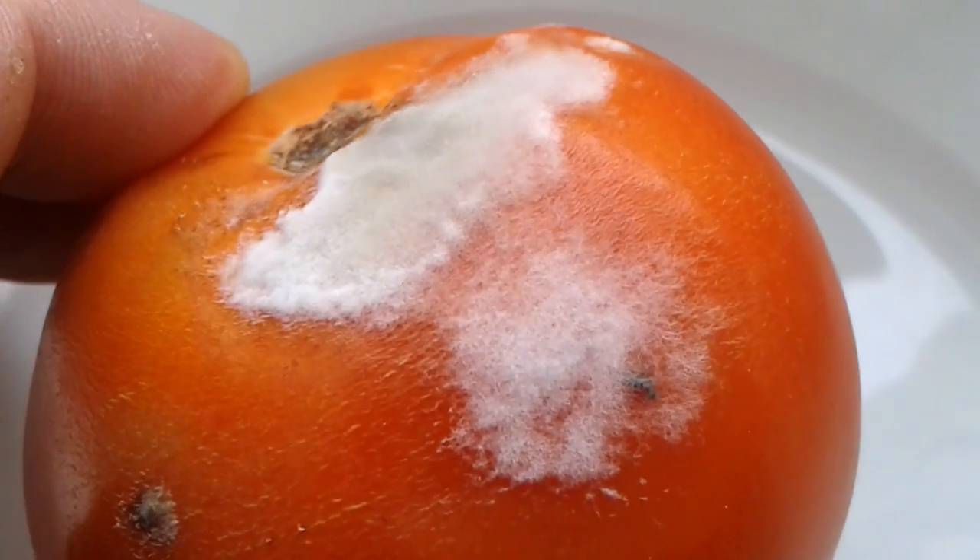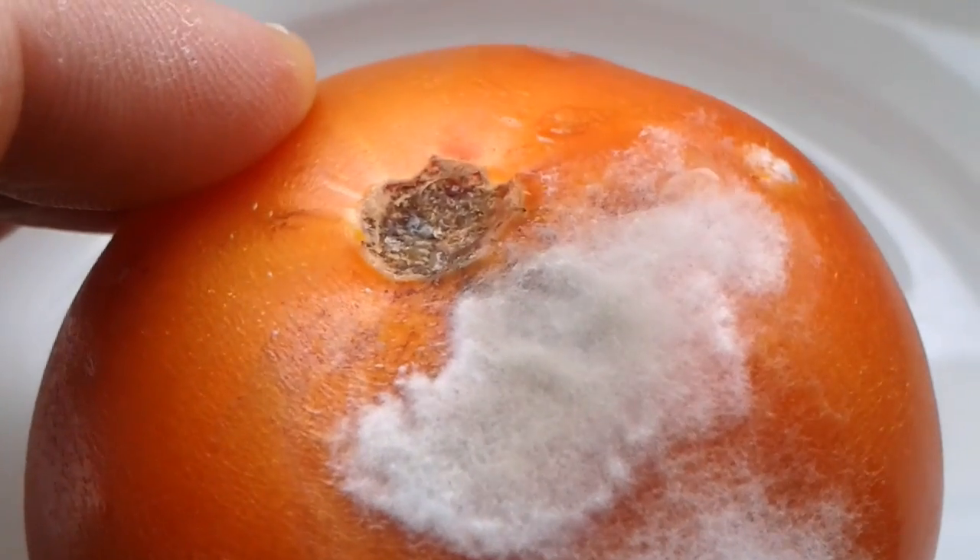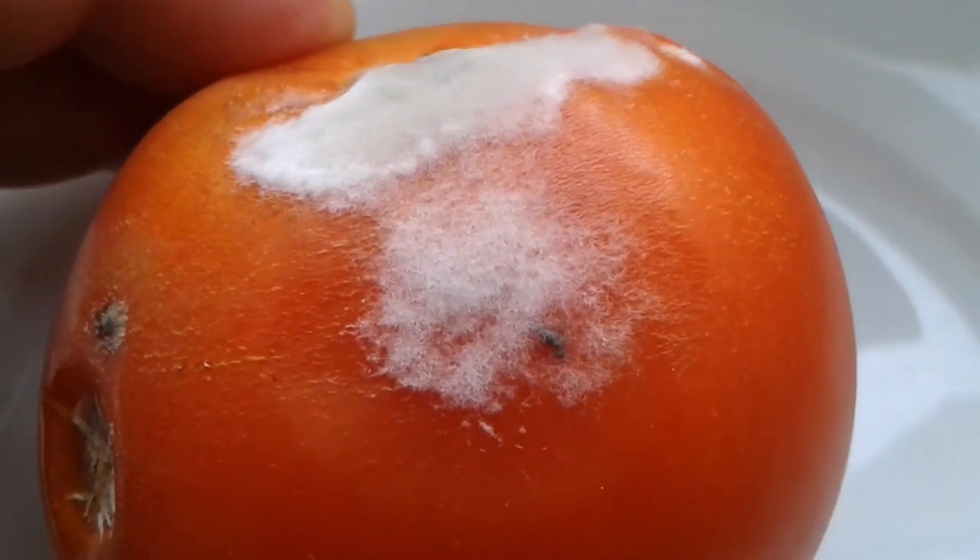This is the fungus in close-up — the white fluffy material. That's the mycelium of the fungus.